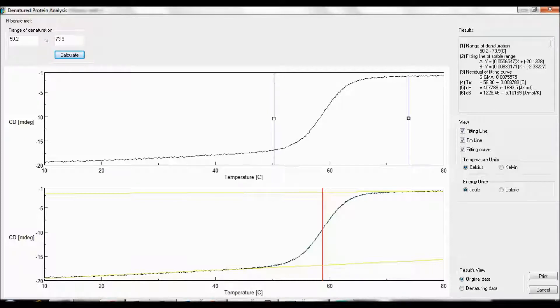You also can obtain a standard deviation of the fitting curve, as well as the melting temperature with its associated error, the change in enthalpy with its associated error, and the change in entropy with its associated error.